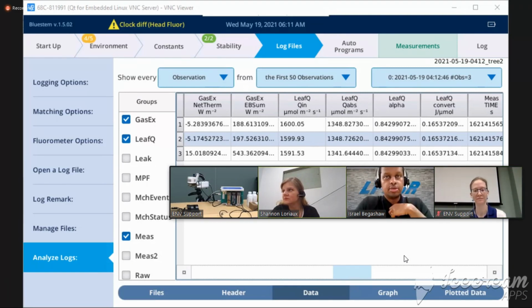What, I mean, was the tree under stress? No. With this high light, the photosynthesis, the assimilation number should be higher, the conductance should be higher, even if the average is low, right? Maybe when we took the measurement, it was covered by the leaf. Maybe that was the reason.